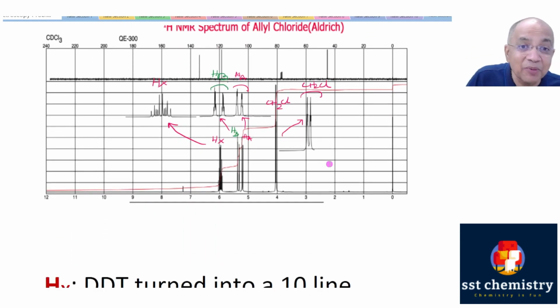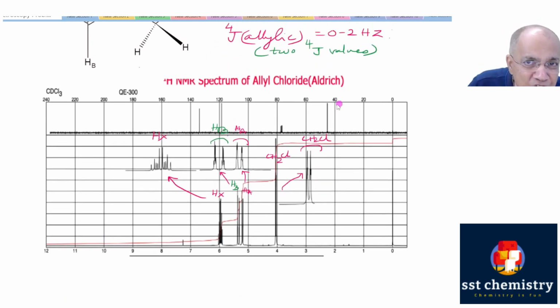Now, coming to the NMR spectrum, the proton NMR spectrum, which is from the Aldrich source, a much more authentic source, Aldrich Chemicals. I have borrowed this from my friend Professor James Novick of UCI, University of California, Irvine, US. He has expanded all these 4 peaks. In fact, there are 2 peaks here, 1 peak here, and 1 peak here, 4 peaks. This is for HX. We'll see why it is HX. And the expansion is here. I will show further expansion by zooming it.